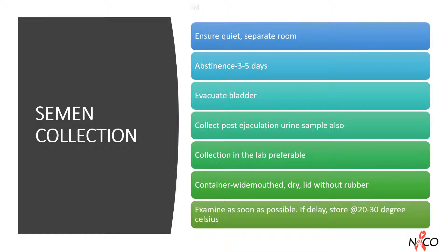The most satisfactory sample is when collection is done within the lab to enable assessment of liquefaction time. If the sample is collected at home, it should be delivered to the lab within one hour. Samples should not be collected in condoms as the powder or lubricant in condoms can be spermicidal. Home sterilized containers should not be used as detergents can be spermicidal. Water is also spermicidal, hence the container must be dry. The lid of the container should not have rubber lining as contact with rubber can result in sperm death. The sample should be examined as early as possible; if delay is likely, store at 20 to 30 degrees Celsius. Maintain confidentiality.